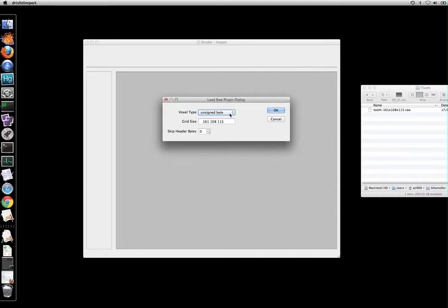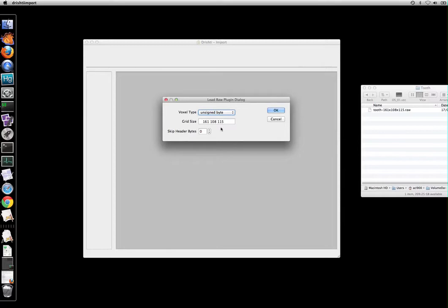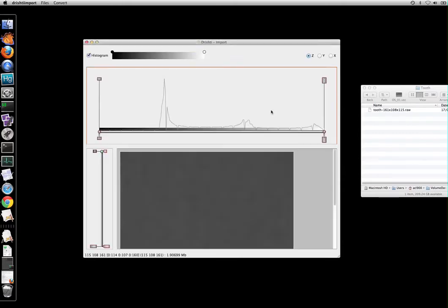So you go and change the voxel type. You have unsigned character, character, unsigned short, short, int and float, and then the grid size can be changed. You can also skip the header bytes. Now in this case we don't want to skip any header bytes. We just want to take as it is, so select ok.